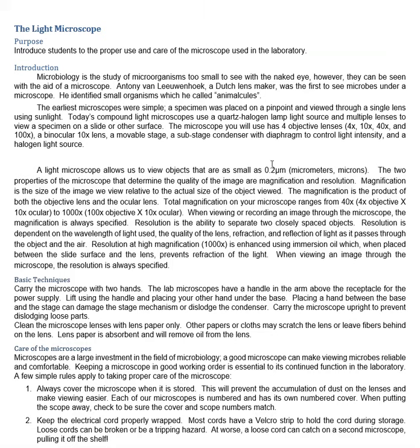So, some things are just too small for us to see with our eyes. So, what we have to do is get magnifying lenses and use those to make the image appear larger. And that's basically what a microscope is.